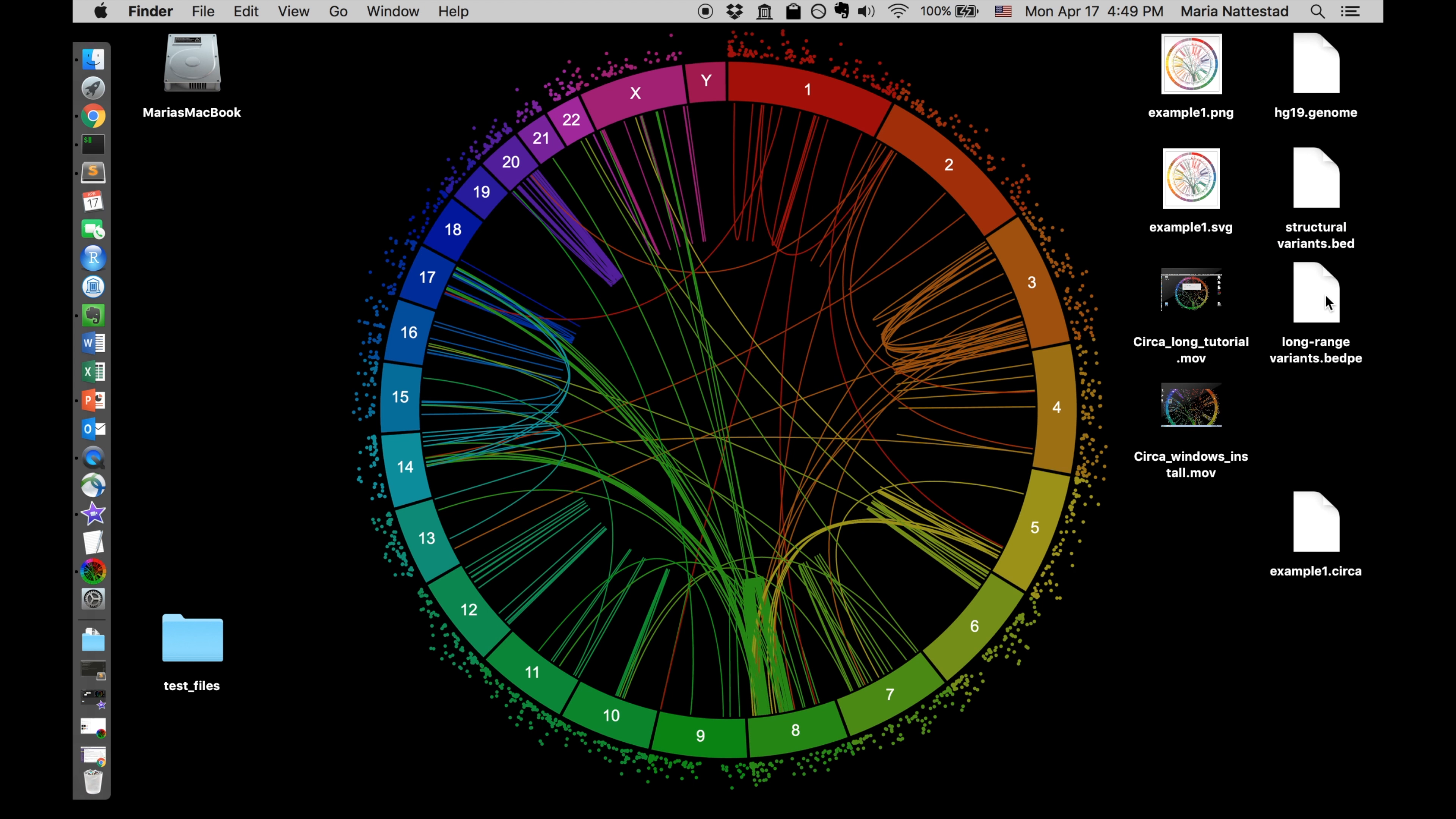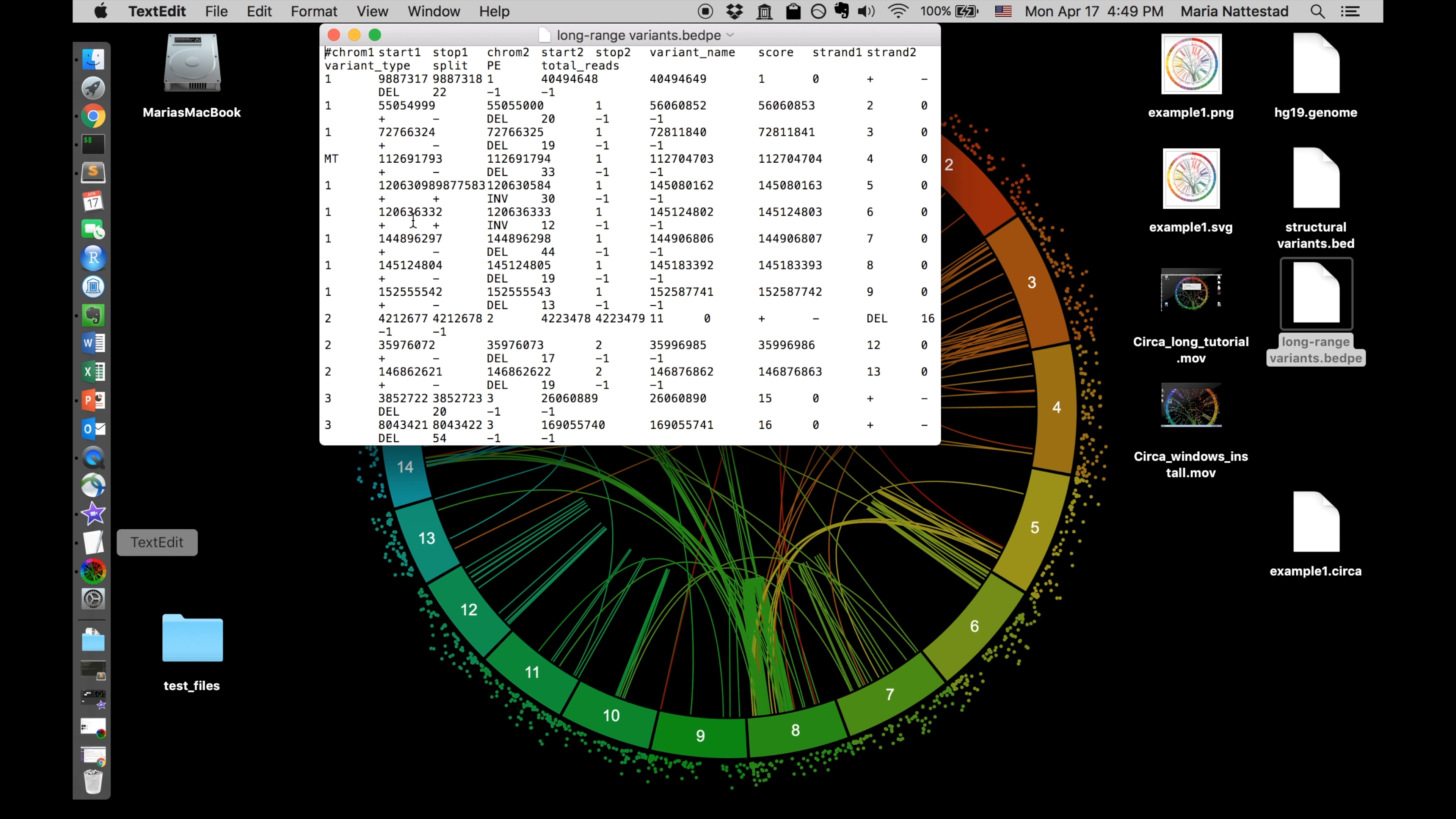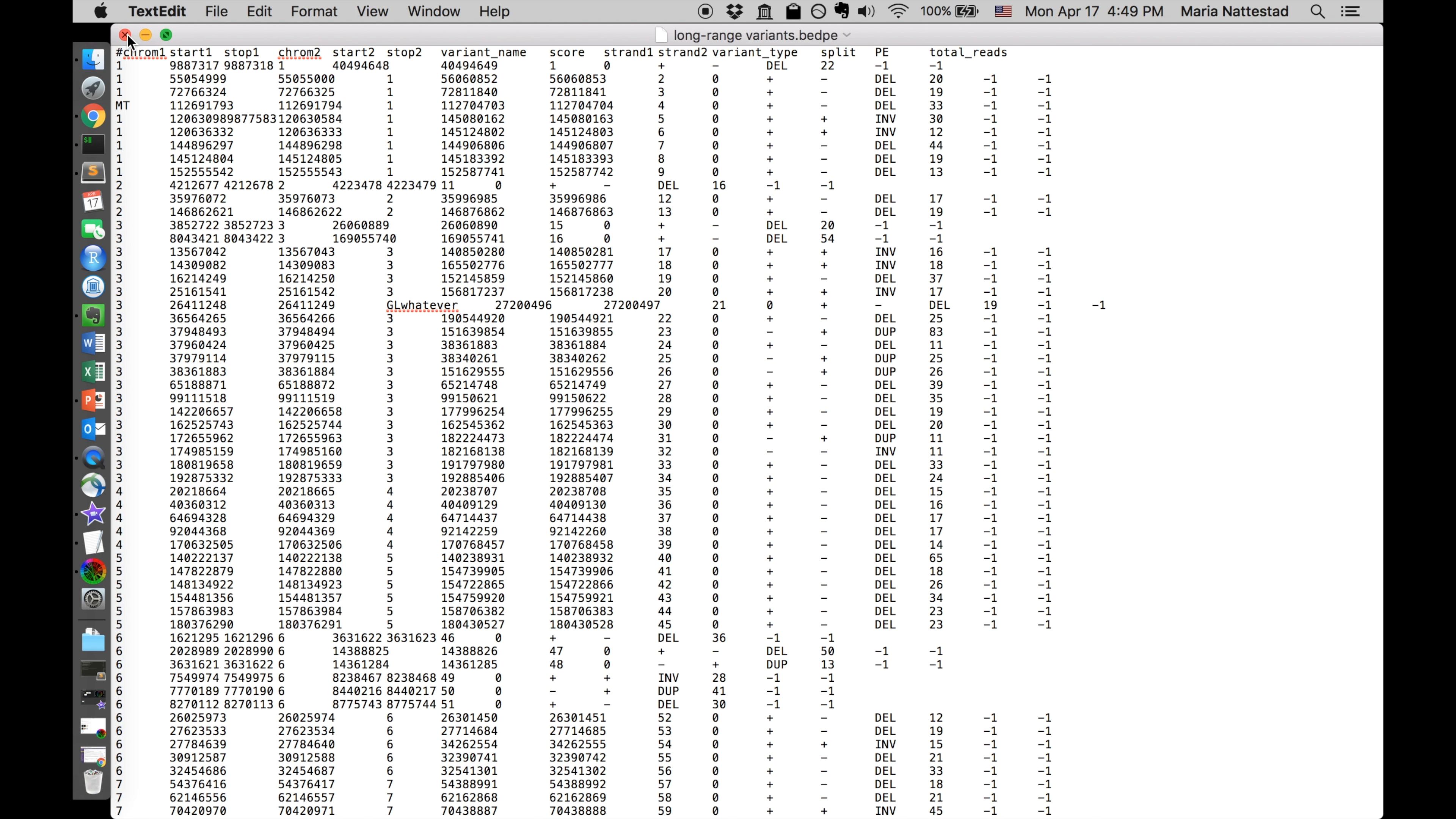The third kind of file I'm going to tell you about here is a bed.pe file. This is a bed.pe file which has a chromosome start and stop all labeled one and then a chromosome start and stop in the second position on the genome. So these are long range variants. And here we would be plotting from the first chromosome to the second chromosome. Again tab separated always got to have a header.